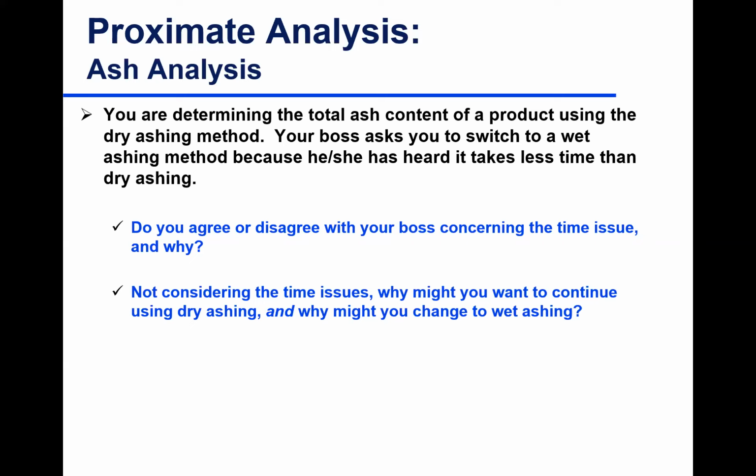Yes, if we want total ash content, that is a key point. That would be one of the things, that it depends on the objective. Why are you doing ashing? What's the purpose of ashing in your company? Are you ashing to get total content of ash for proximate analysis? Or are you ashing to do mineral analysis? If you're ashing to get total ash content, that ends the discussion right there and then. You can just educate your boss and tell them, the wet ashing won't give me total ash. Okay, that ends the discussion there.